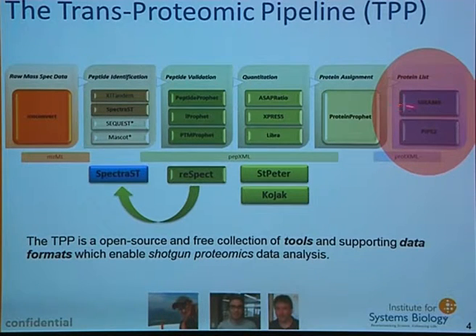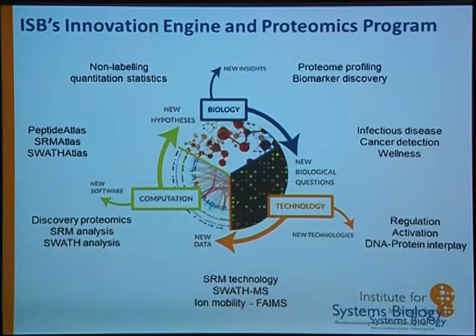There's a couple of other tools that we're not going to talk about, but when you've gone through all of your efforts of collecting your mass spectrometry data, doing all those statistical analysis tools, your protein inference, then you can store it into a relational database in which it becomes a PeptideAtlas. And that gets served back to the community. So all of our results, you can go and peruse and look at all those different applications.